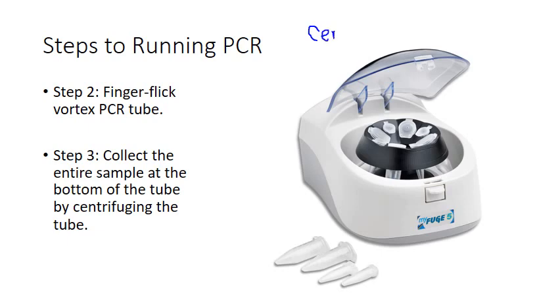It holds microcentrifuge tubes. You will have to know everything about centrifuge equipment, how to operate it, what centrifugal force is, and how that correlates, all of that stuff.